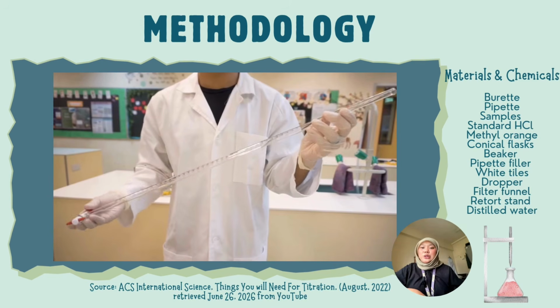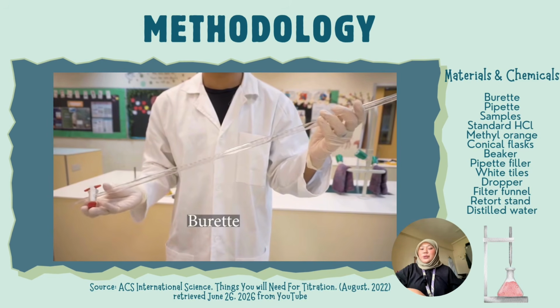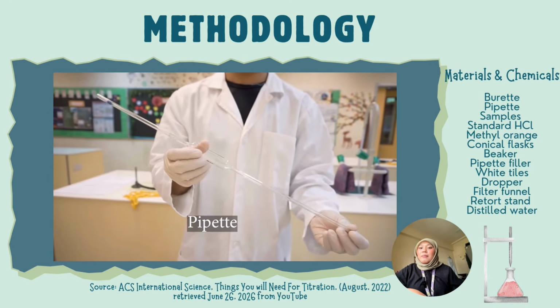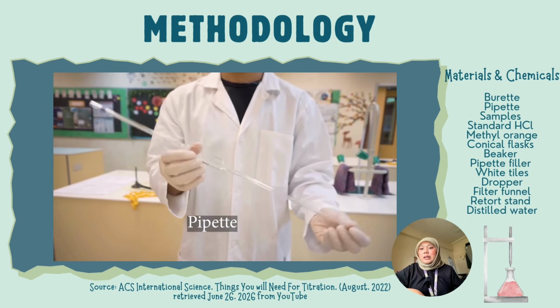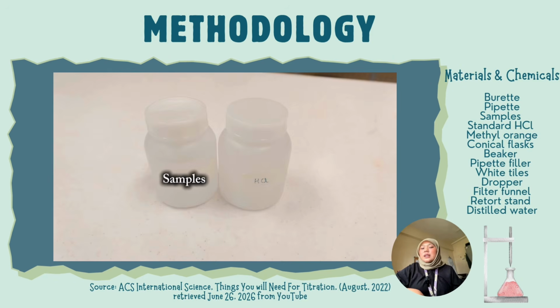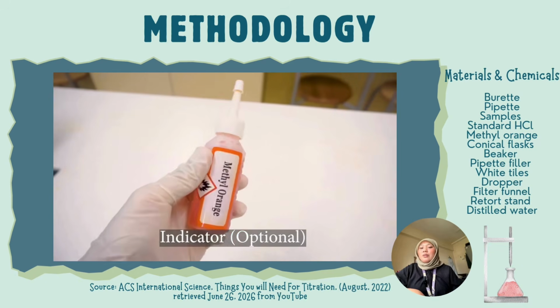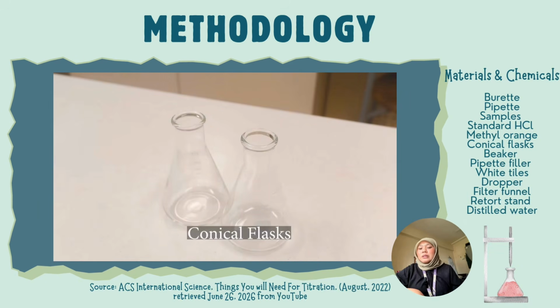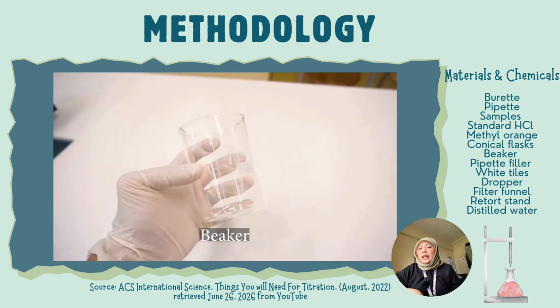This is the methodology. The materials used in this experiment are shown on the slide. The main apparatus include a burette, pipette, conical flask, beaker, retort stand, and white tile. The chemicals used are standard hydrochloric acid as the titrant, methyl orange as the indicator, distilled water, and the water samples, which are river water and rainwater.